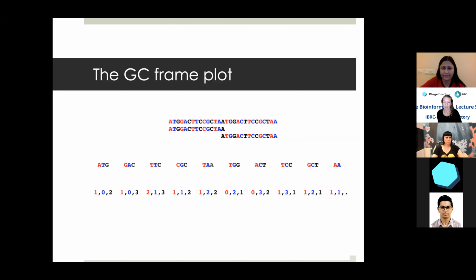Okay, so dear Katelyn, just need a little confirmation. Does it mean when we're using PHANOTATE, we should recheck the result using Artemis to make sure we don't miss such a gene? Yep, you always do that. None of the programs themselves are 100% correct, and certainly PHANOTATE isn't. It's one of the more accurate ones, but it's not 100% correct yet, although I'm trying to get it there.